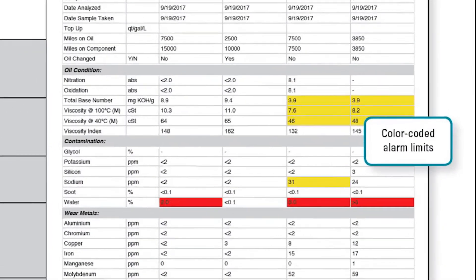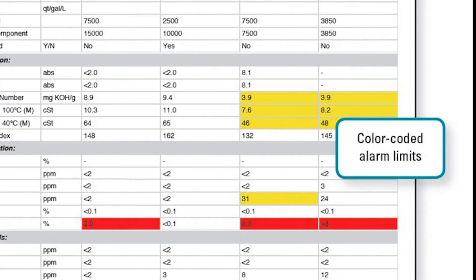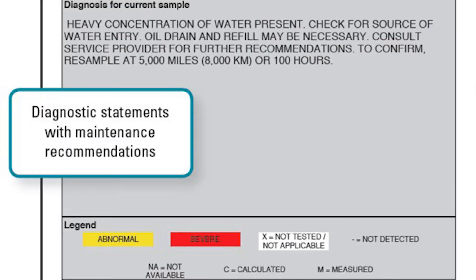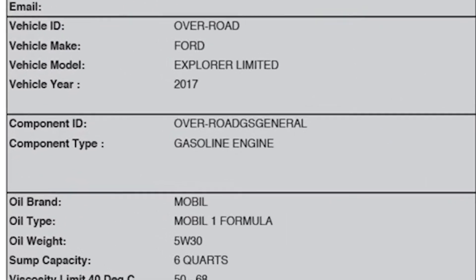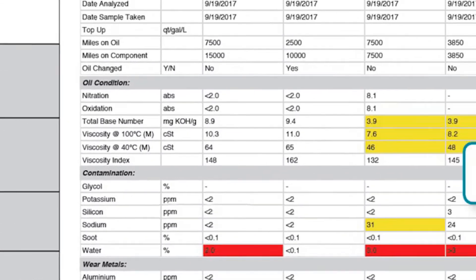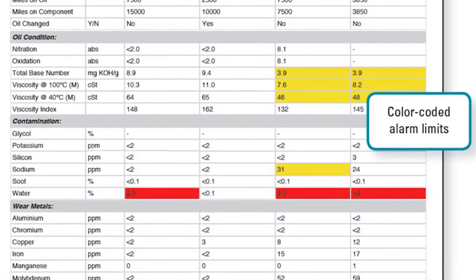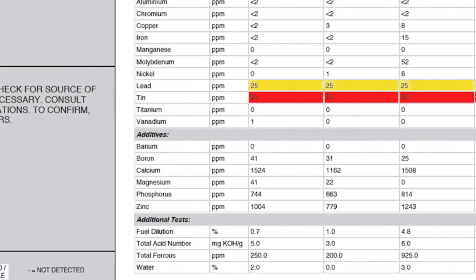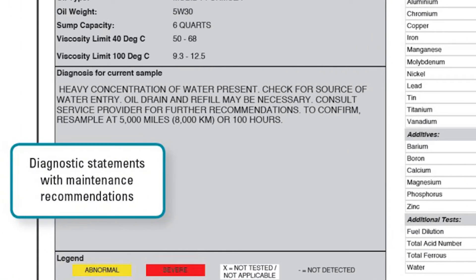The Microlab report includes color-coded alarm limits, sample history, and diagnostic statements. The Microlab user inputs information about the equipment, component, and oil that's being tested, and the Microlab's expert system produces a report that includes all of the analytical data that a typical oil lab would provide, along with a series of diagnostic statements which advises the mechanic to possible equipment issues and also indicates the oil condition.